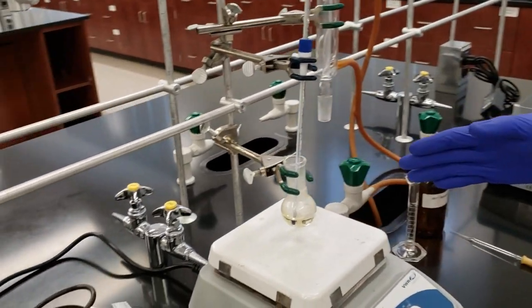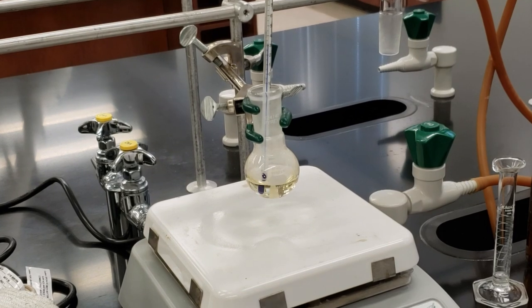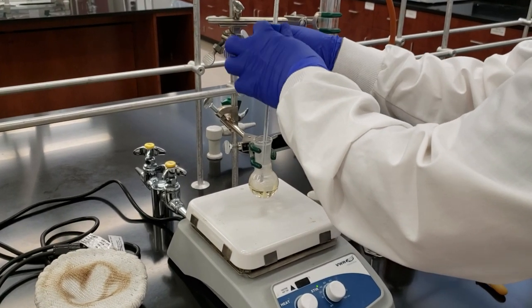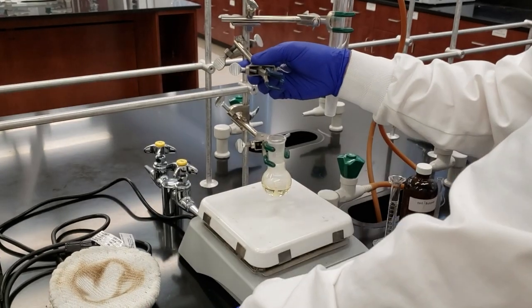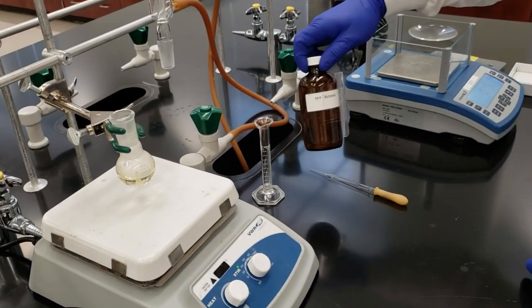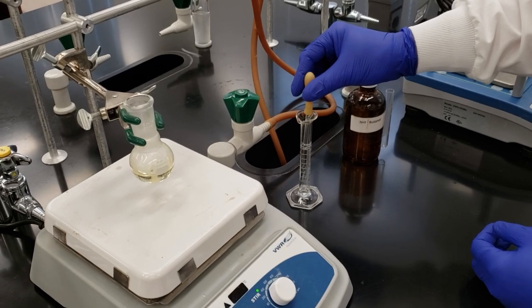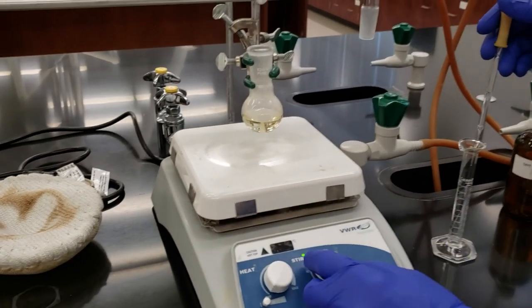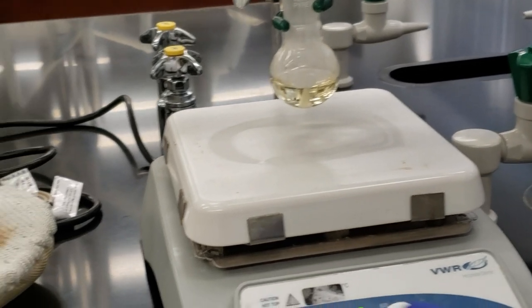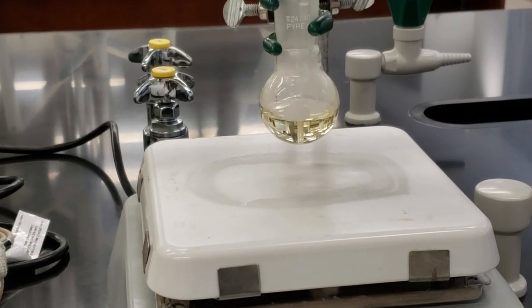We've reached our desired temperature in our reaction flask. It's stirring gently here. We're going to go ahead and lift the thermometer out, and I'm going to add in my tert-butyl alcohol. We've got 1 mL. We'll go ahead and pipette that up. I'm going to place the tip of my pipette right near the bottom of our flask. I don't know if you can see that. Is that visible? Yep. Okay, and then we're just going to slowly introduce our tert-butyl alcohol.